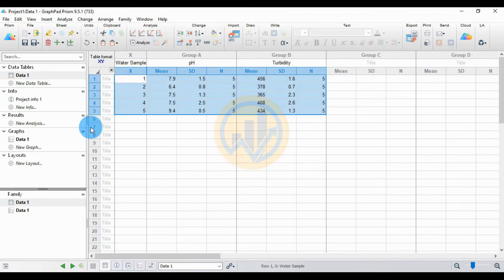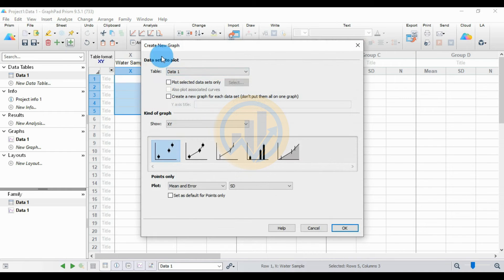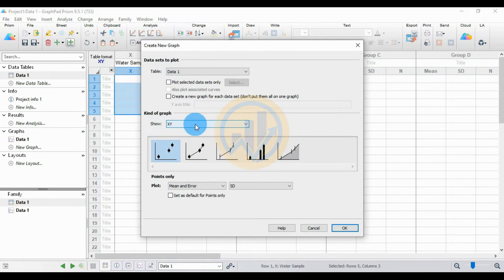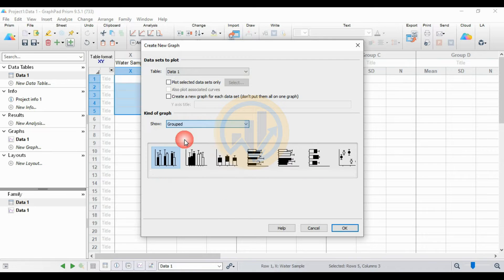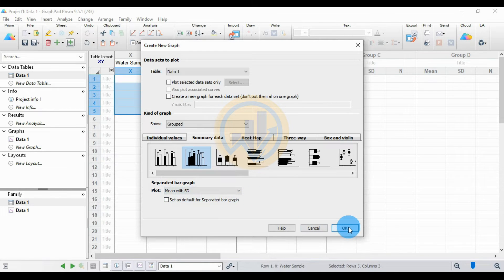Open the worksheet in GraphPad Prism and paste the data. Now click the button to create a new graph for the existing data. A new tab opens for the graph. The data table is 'Data 1.' Select the graph type: 'Grouped' and 'Summary data,' then select the second option — a separated bar graph plotting mean with standard deviations. Click the OK button.